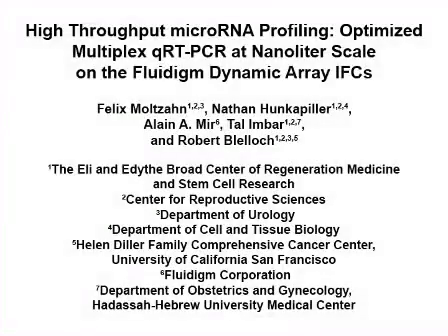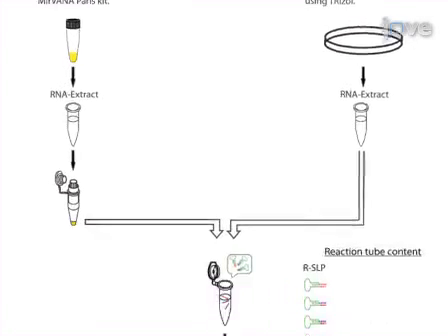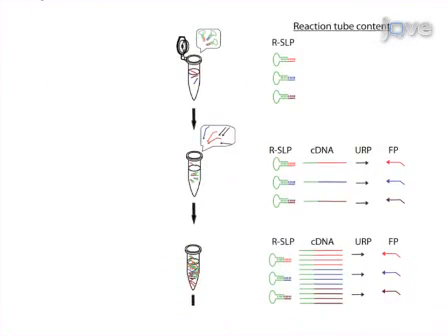The overall goal of this procedure is to profile microRNA expression efficiently, inexpensively, and with minimal starting material by combining multiplex quantitative RT-PCR with a microfluidic platform.